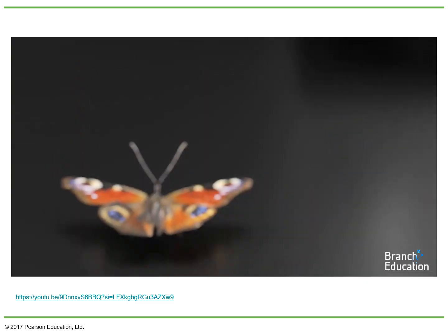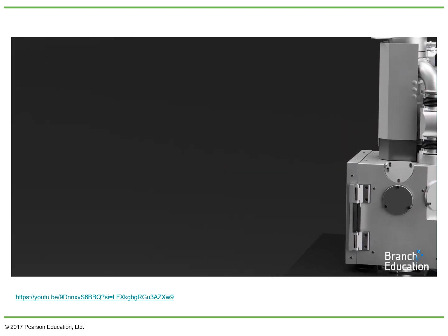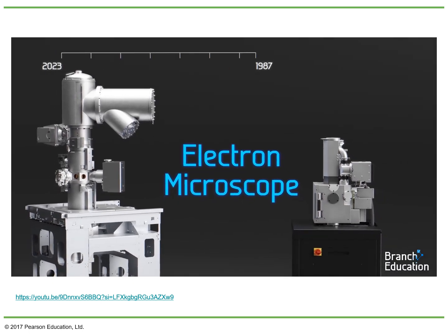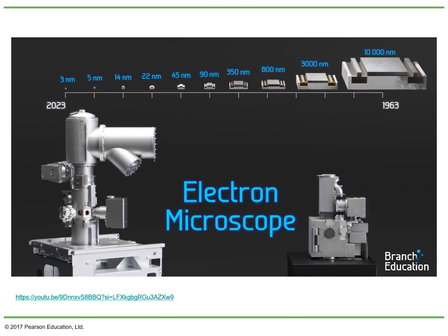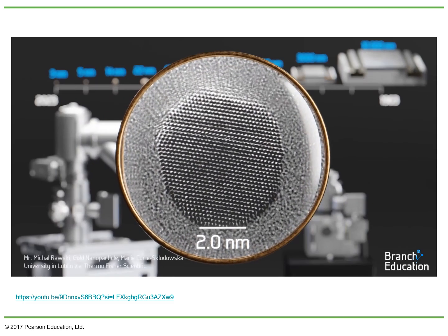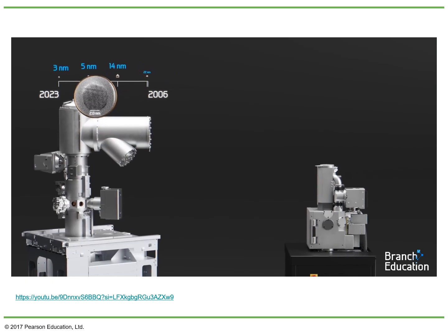Although this wing may not be directly related to the technology you're familiar with, scientists and engineers have been using electron microscopes for the past 60 years to develop smaller and smaller transistors. And with today's technology, this microscope can zoom in millions of times to where it's able to capture images of individual atoms. There are two main types of electron microscopes.